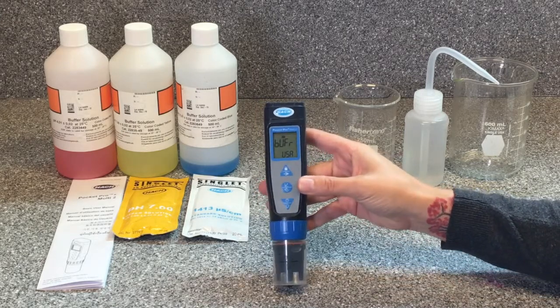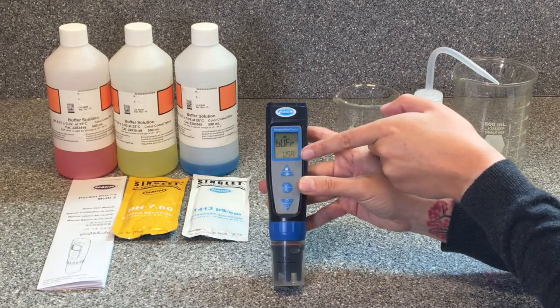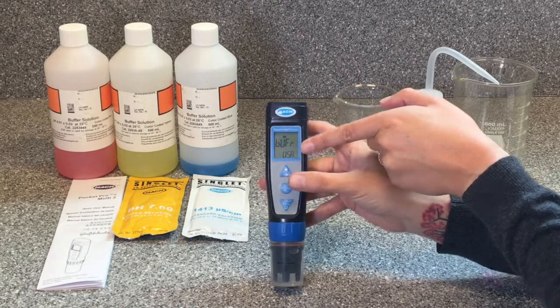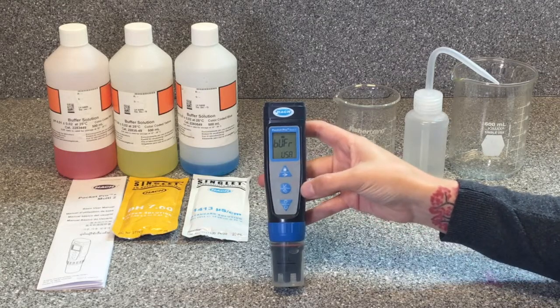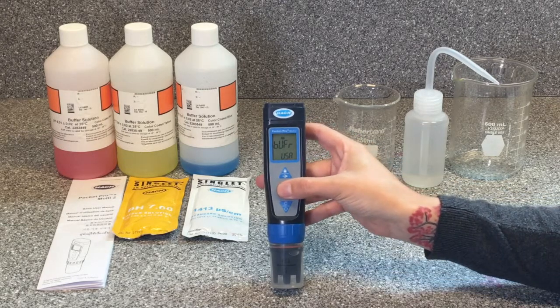That brings us to our first calibration setting — it should say 'pH buffer.' We need to make sure that it says 'USA' on the bottom of the screen, so it will use the standards that come with our Pocket Pro. If yours does not say USA, scroll through the options by clicking the arrow button once until it reads USA on the bottom. Once that's set, we can advance to the next setting by pushing the settings button once.